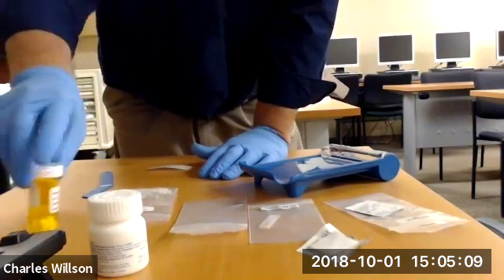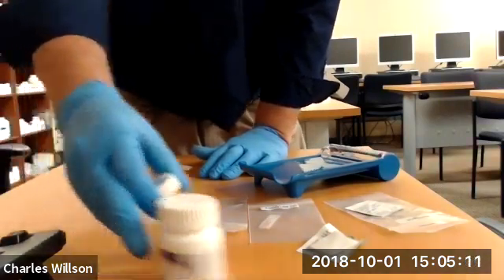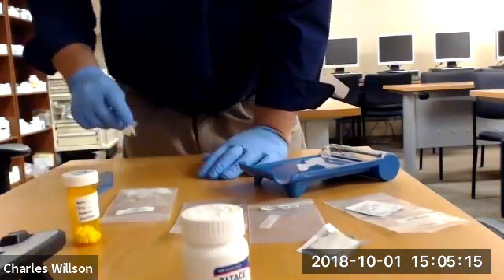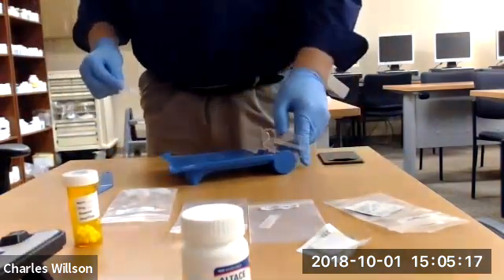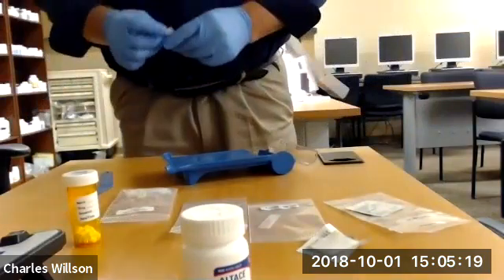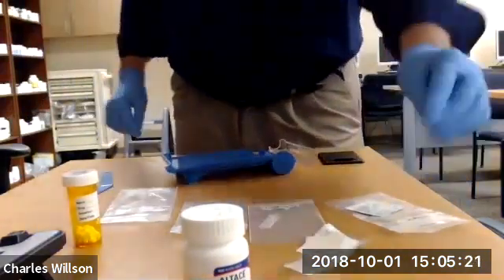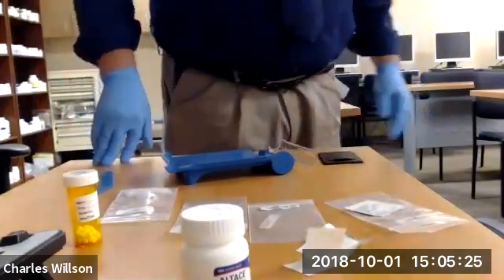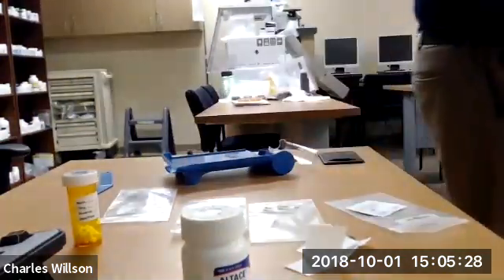In practice, I didn't write anything on this label because honestly, in practice, the computer would have printed the label. You all had prescriptions filled. You know how that looks. Okay, and the label goes on the bottom. Boom. That's the way that works. Okay. So that's the first phase.